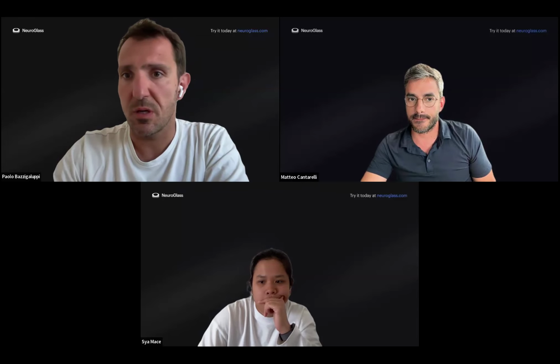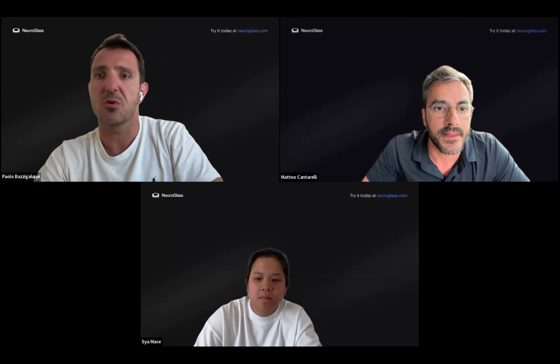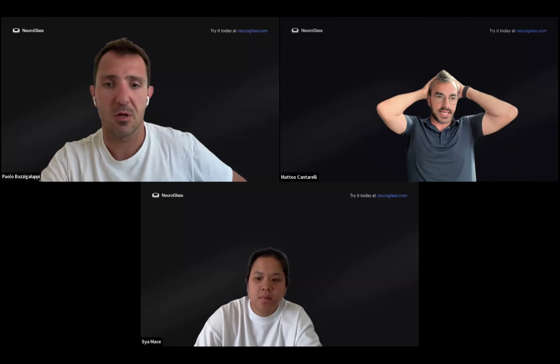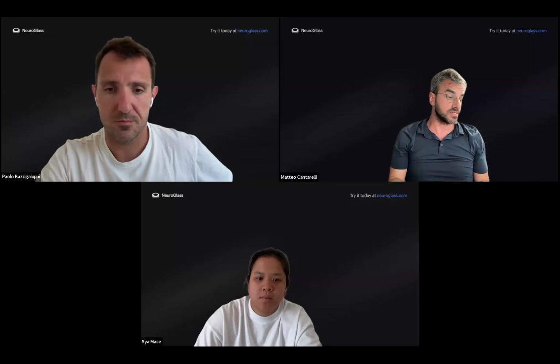I have a question, Matteo, about the skeleton. There is a question: what kind of skeleton tracing capabilities are we working with? So we are adding, thanks for the question, one main thing on Neuroglancer, which actually there is already a pull request for.